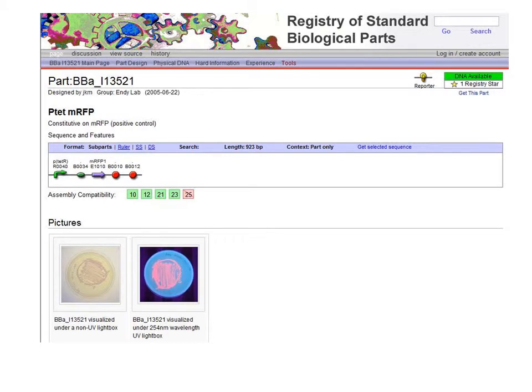Effectively, they are databases with user interfaces and a small amount of business logic. The Registry of Standard Biological Parts was started at MIT in 2003 based around Tom Knight's idea of a biobrick part. Each brick encodes a piece of information such as promoter, coding sequence, or terminator, and there was one standard assembly method for assembling these parts together, the biobrick standard assembly reaction. Each part has an entry within this database, presented to the user as the Registry of Standard Biological Parts website. A sample of plasmid DNA encoding the part is housed in a centralized repository and distributed.